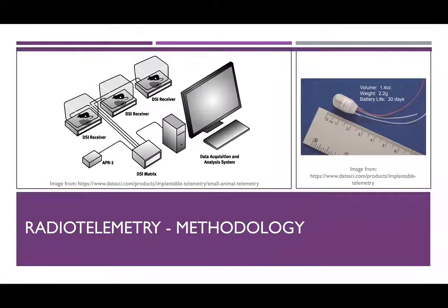So just to move on quickly, we also conducted some longer term studies using radio telemetry. And I know many of the individuals that have joined the webinar today have probably had perhaps even more experience than I have using this approach. But just very quickly, animals are implanted with a radiotelemetric device that is able to monitor a number of variables, so temperature, movement and activity. You can put ECG leads in and get an ECG recording, and as well mean arterial pressure and heart rate. And so we used this system where the animals were implanted with one of these small transducers.